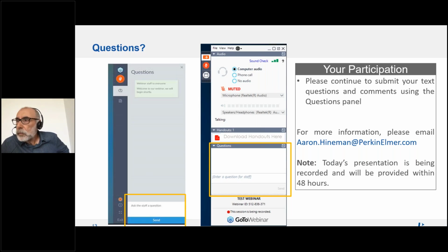Okay, great. And then the next question is, have you tried doing this in surface water samples? And if not, do you think it could work? Or would the interference of bacterial cells and algae be problematic?